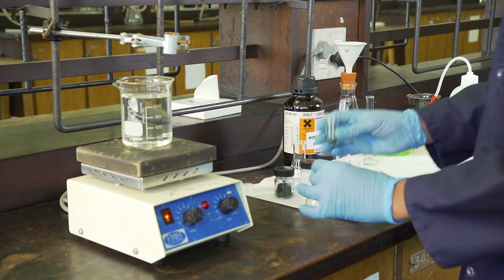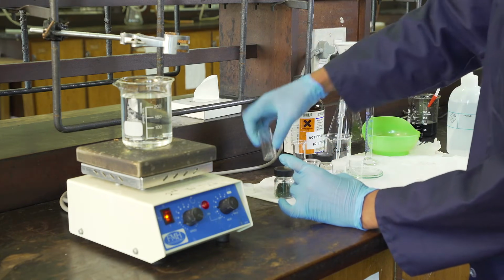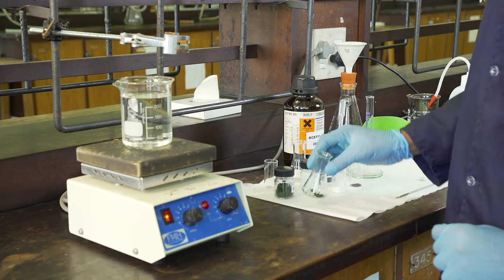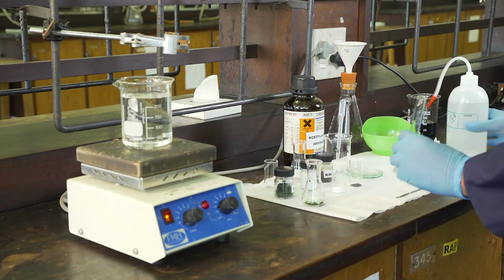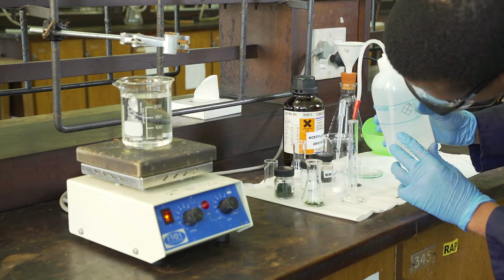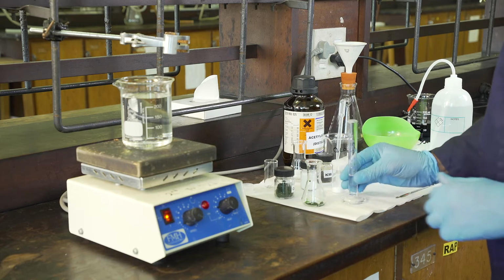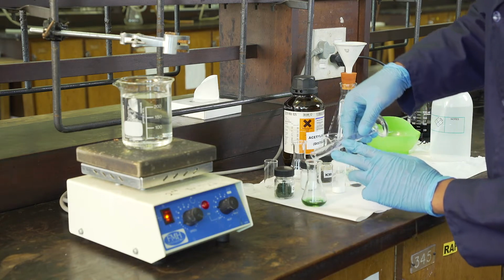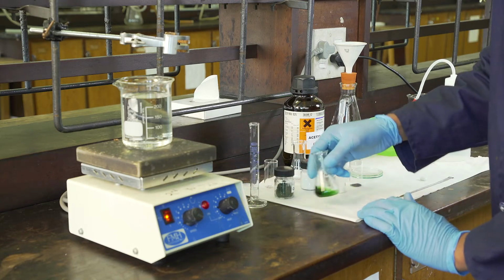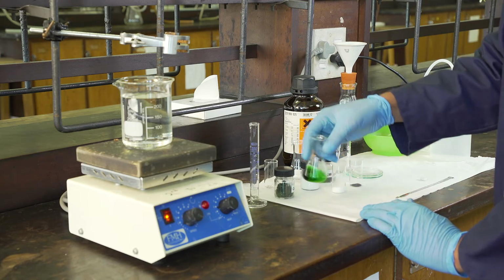you carefully transfer your mass into a 25 ml conical flask. Once you have done that, you then use a measuring cylinder to collect 4 milliliters of distilled water. Transfer the distilled water into the conical flask and gently swirl to ensure complete dissolution of your chromium salt.